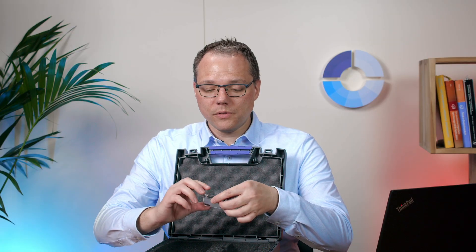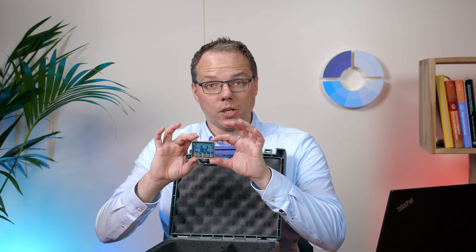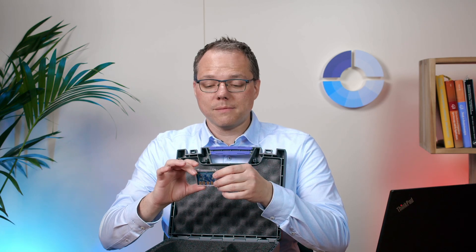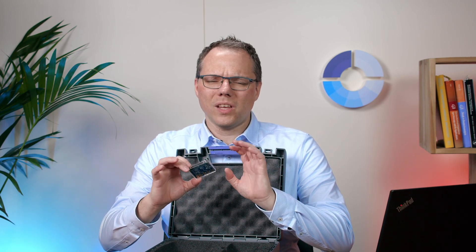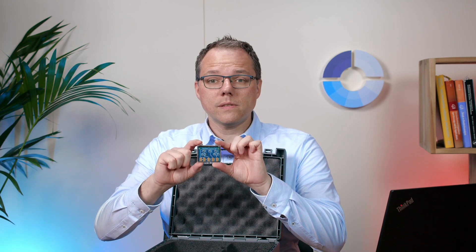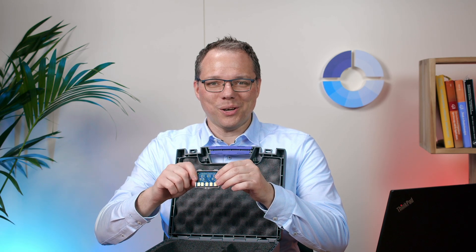You will also find in the box a dummy cell with three different circuits, which should help you to perform your first test measurements. Or if you think the instrument might not be working quite right, you can use the test circuits to check out if your instrument is working as expected.